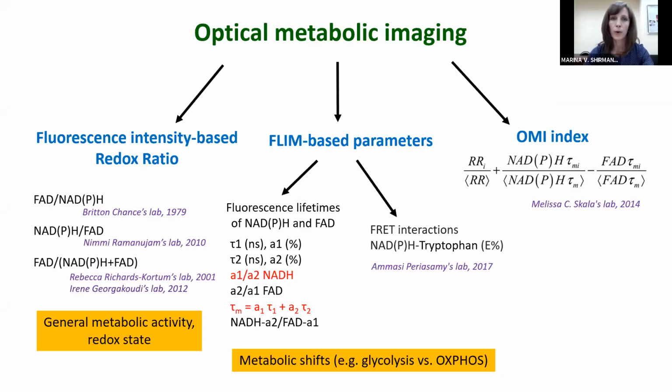Currently, different approaches are used to analyze optical imaging data. They can be generally classified into three classes: fluorescence intensity-based approach, fluorescence lifetime-based approach, and mixed approach.